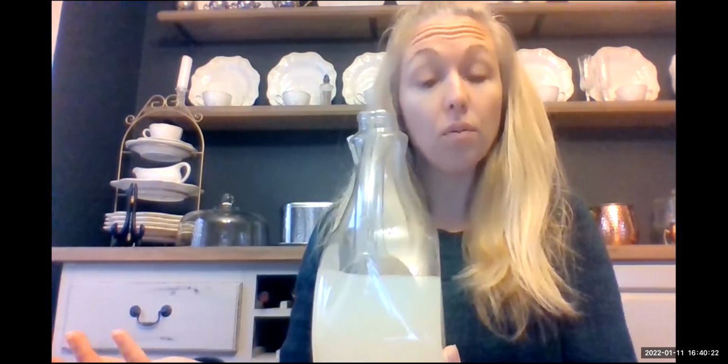And so what that indicates to us, just like with ocean water, salt water, right? If you can separate those parts of this solution without changing them chemically. So homogeneous mixtures, which is what kind of mixture this is, okay, are a little bit more difficult to tell apart. So if you see an item at your station and you're not quite sure, you may want to look at the information on the tray to help you to determine, is it really a mixture or is it maybe an element or a compound?